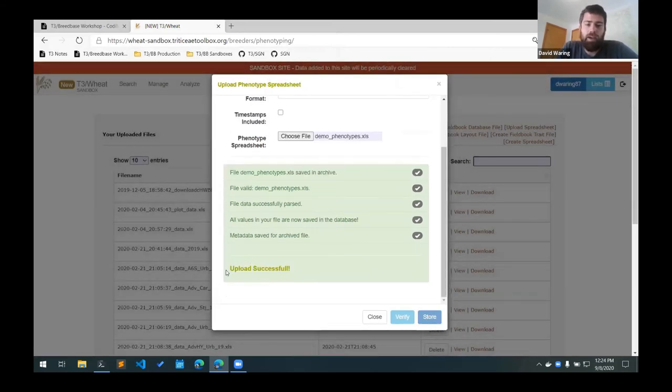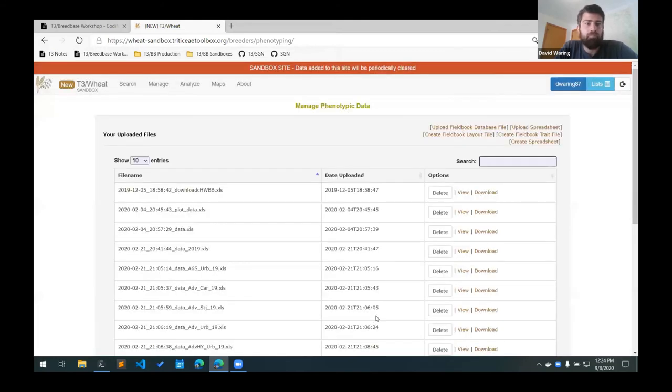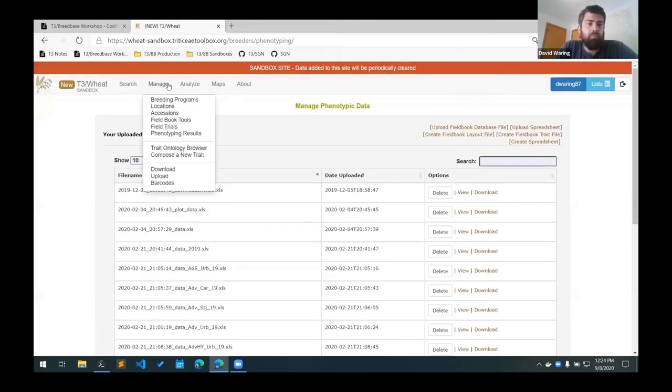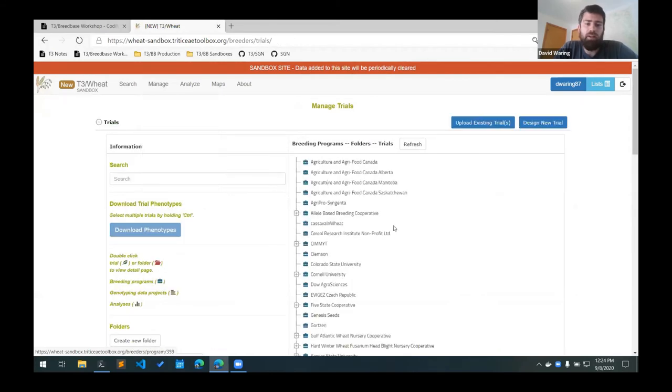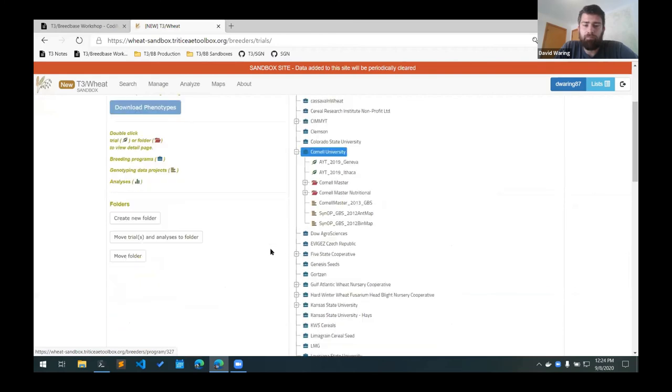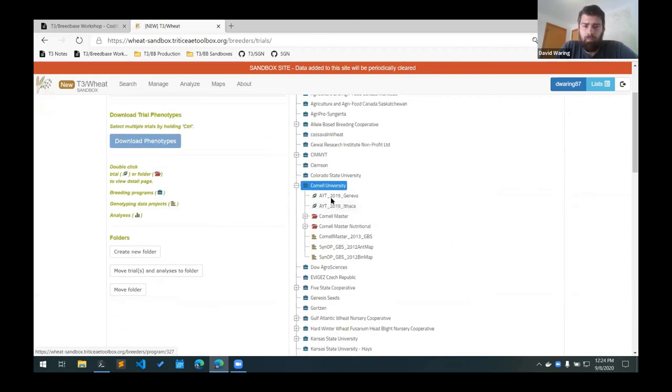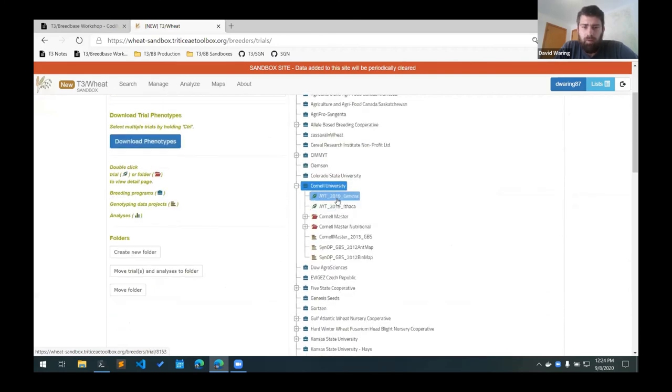So down here we have an upload successful. So that's good. What we can do is we can view our trials. So we go to manage field trials, find our breeding program, and then our locations here.